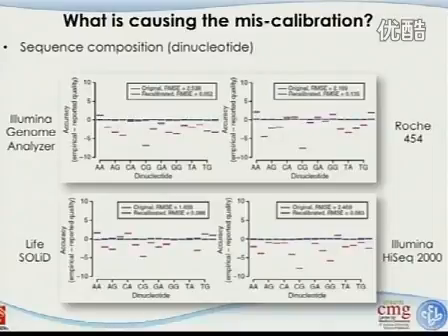All right. And another potential thing that can affect this reported quality is the sequence composition, meaning that here, they only consider the dinucleotides, so AA, AC, AG, AT. We know that some sequences are really harder to sequence compared to others. For example, CG regions are really hard to sequence for some reason, okay?